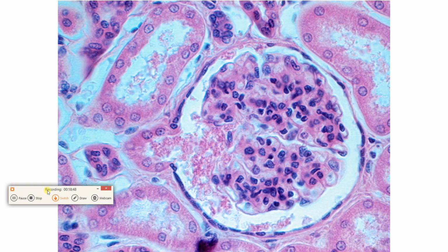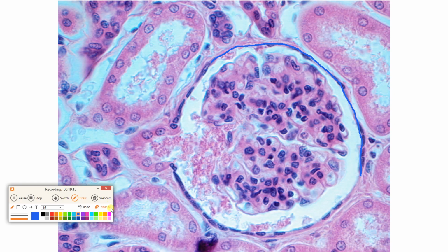Here is another kidney. You're going to see this thing right here. What was this thing? It is a glomerulus. You're going to see this and know that's the kidney, that's the glomerulus, and next to it, right here, is the glomerular capsule. Look at it, you can just draw a line on it, right? So it is simple squamous epithelium. All right, cool. Done with simple squamous epithelium.